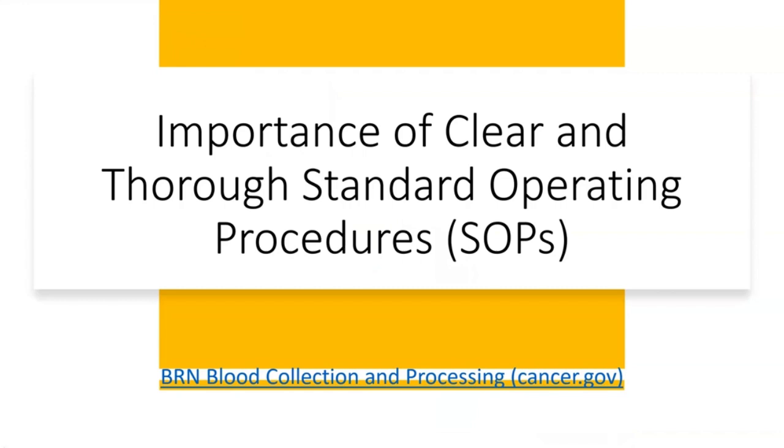Finally, it's really important that you have good, clear, and thorough standard operating procedures. And that goes throughout this process of biospecimen collection. So I spend a lot of time putting great detail into how I'm going to collect it so that even if I'm not collecting the sample, if somebody else has to pitch in for me and go out and do the data collection, or we have a research assistant doing that, they have the exact process that I would use if I were going out there. And that's really well thought out.